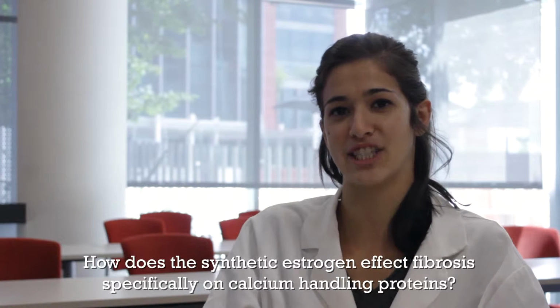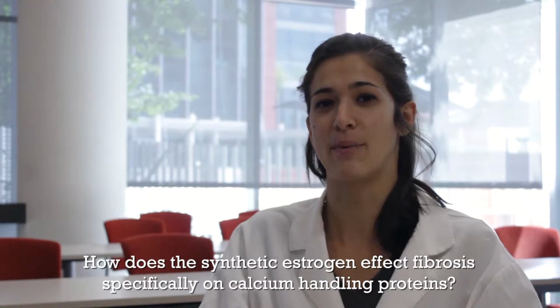However, my research question is, how does a synthetic estrogen affect fibrosis specifically in regards to the effects it has on the calcium-handling proteins, such as SERCA, phospholamban, and the sodium-calcium exchanger, which are major proteins in the heart muscle cells? The technique used for this is Western blotting. It is the transfer of a sample from a gel to a membrane. By doing this, it detects the relative amount of different proteins present in each sample.